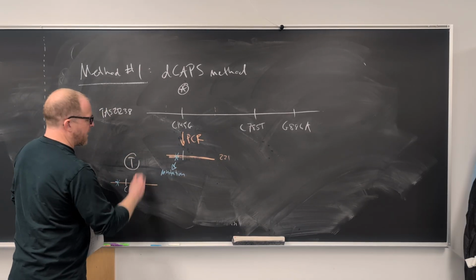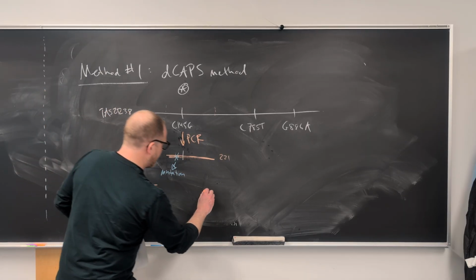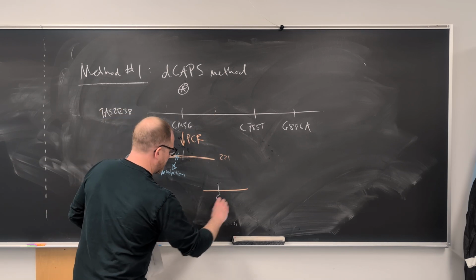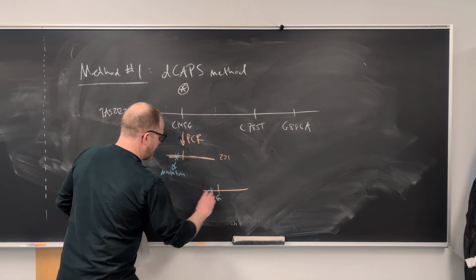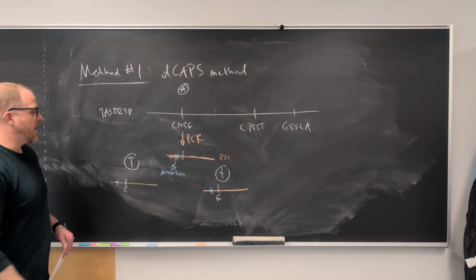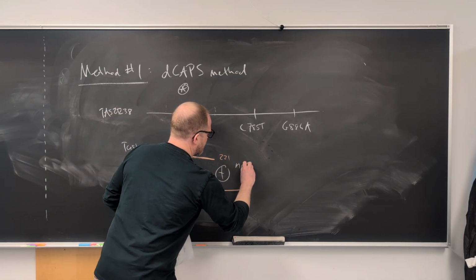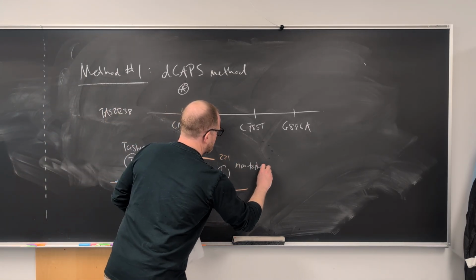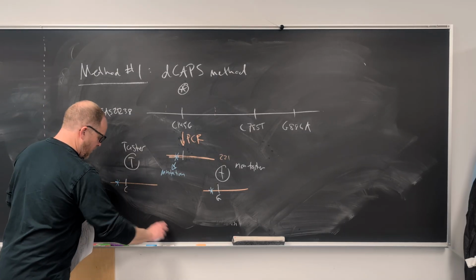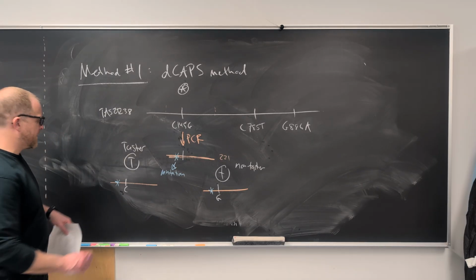Whereas it's possible to have another PCR product if there's a non-taster allele in there that will have the same length. It'll have the SNP there, but in this case it'll be a G, and there will also be that mutation introduced. This is the PCR product derived from the lowercase non-taster. So this is the taster and non-taster. Now, importantly, this mutation only introduces a restriction site in this PCR product.